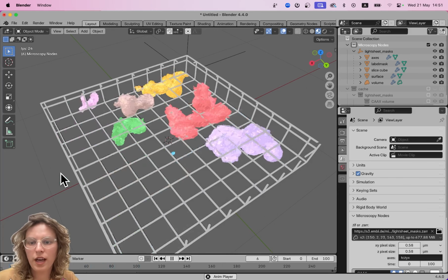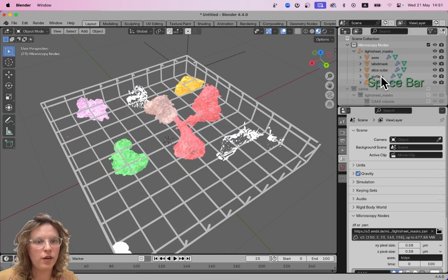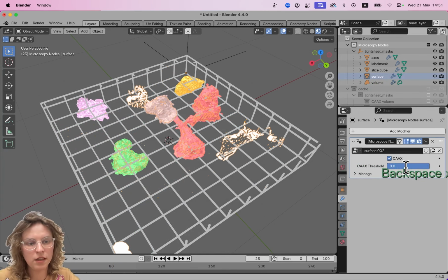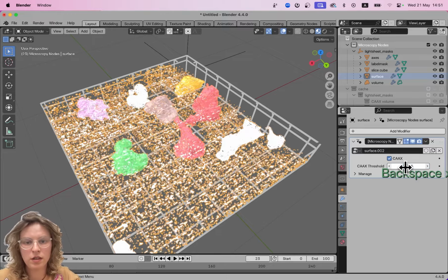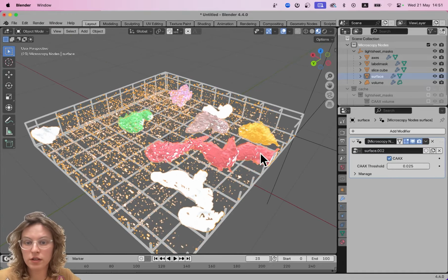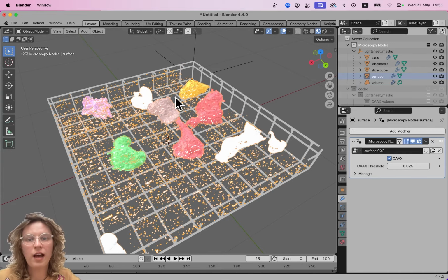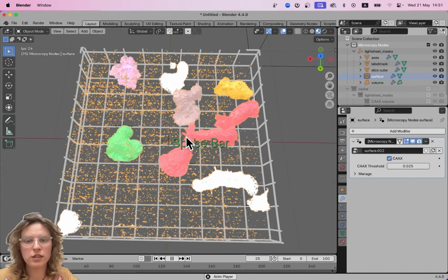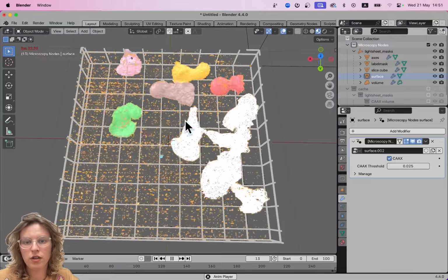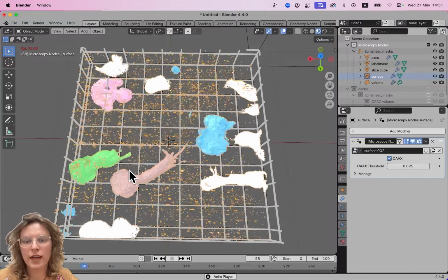So right now we have in white our surfaces from the membrane stain, from the data. So we can also make that fill, but then we see all of our noise here. And then we have the few ones that were successfully segmented, and we can see that those are mostly tracked through time.